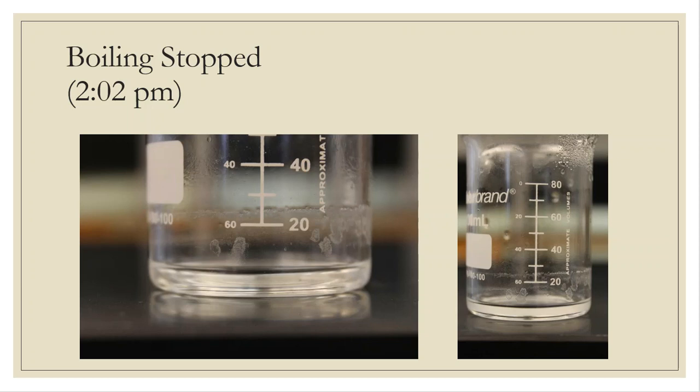of the beaker. What I have left over right now, this is the alkane, and it's one of those two alkanes that I started with in the very beginning. I just got to figure out which one it is. Well, I need to let this beaker cool, because part of the lab directions are going to tell me to get a mass of this. How much did I recover? How much did I reclaim?